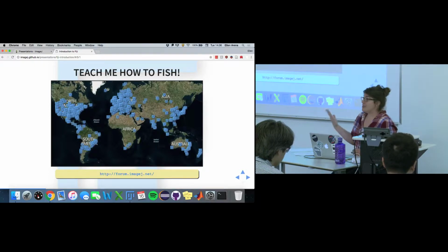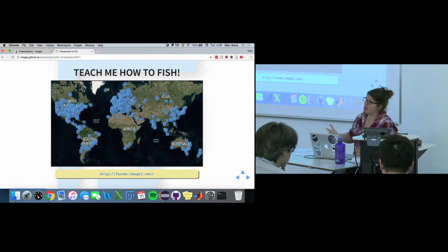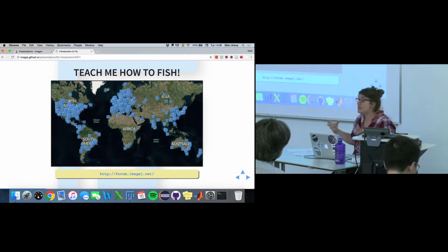So what's cool is that sometimes if you're up late, you're thinking about your question, you post something on the forum, you could potentially wake up the next morning with your answer because of the time change. So many users across the globe are on there. It's a really great tool. And this is the strength in ImageJ: that community that exists and that you have access to. And one of the ways you have great access is via the forum.